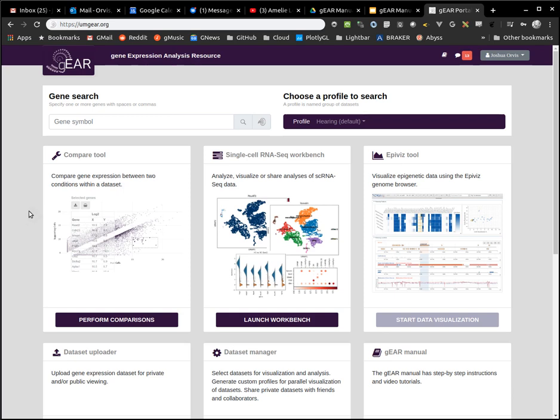In this tutorial, I'm going to show you how to create permalinks, both to profiles and individual data sets, and then how to use them if you've received a permalink from someone else. Let's start with using them, since that's a little bit easier and probably the more common case.